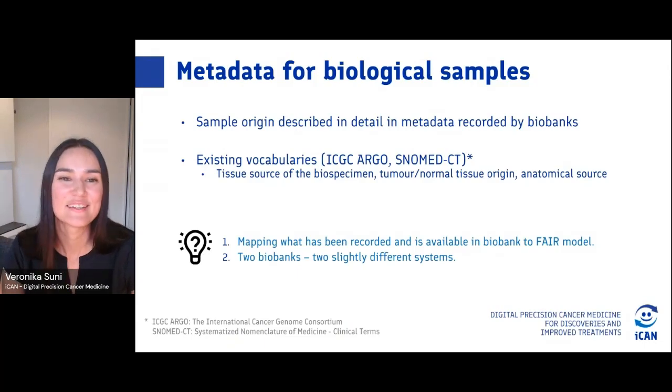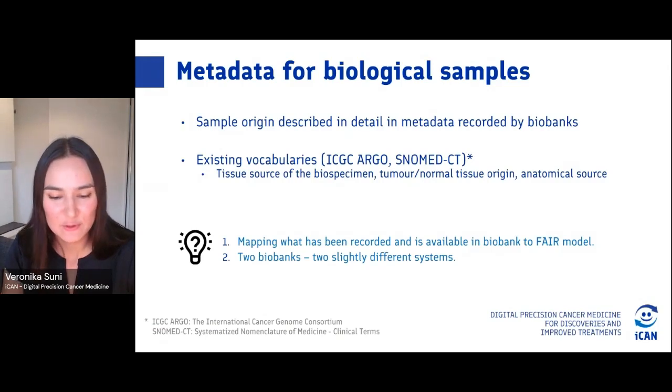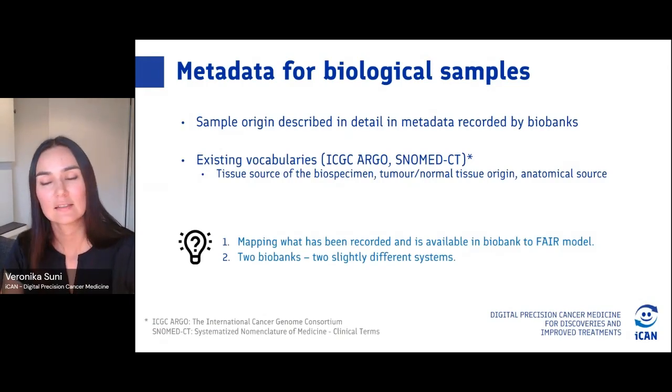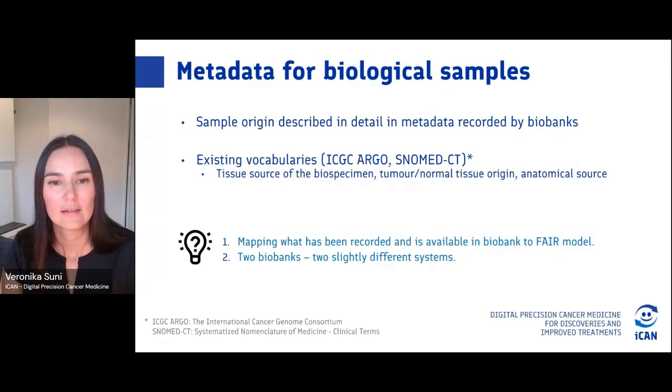So this was a long introduction to first talking about the biological sample. Lucky for us, we're working with biobanks that keep great track of sample origin. So that is available in detail.